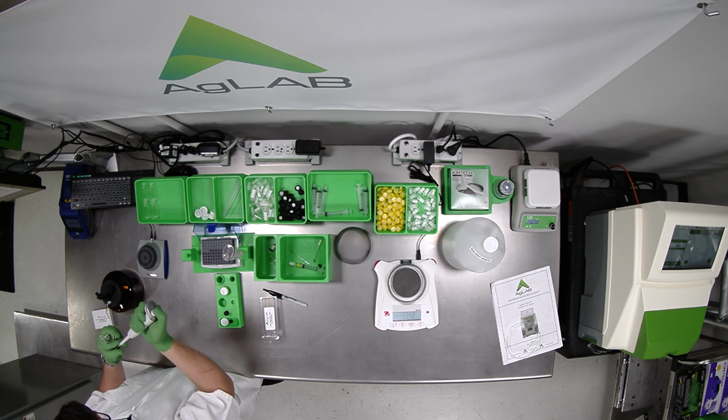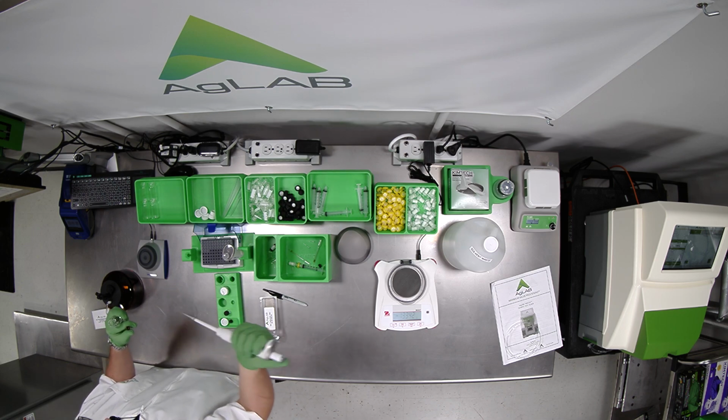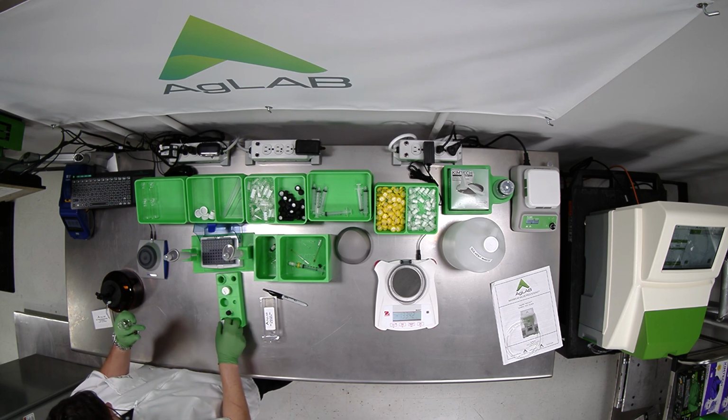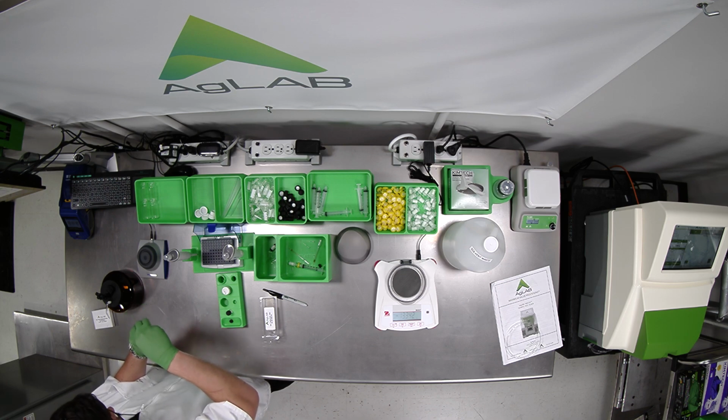I'm depressing the pipette, and I'm sort of bending the tip along the side of the walls, just to get any little droplets that may get caught up at the end of the tip. Again, this is the most important transfer in the procedure, so you want to make sure to get all of your cannabinoids.